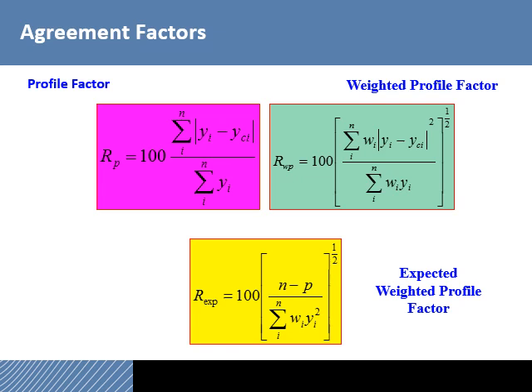In one case, you square it and then take the square root. In other cases, just a direct profile factor and so forth. We don't really need to talk about those. But whenever you do a Rietveld refinement, there is some type of residual error indicator, and you obviously want to minimize that value. So the lower the residual error, the better quality refinement you hopefully have done.